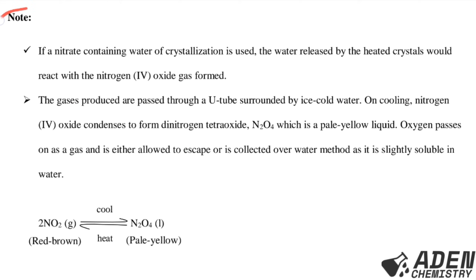Next we are told, note, if a nitrate containing water of crystallization is used, like maybe copper 2 nitrate, the water released by the heated crystals will react with the nitrogen peroxide gas formed, as nitrogen peroxide gas is soluble in water.